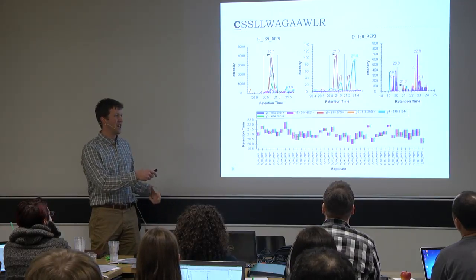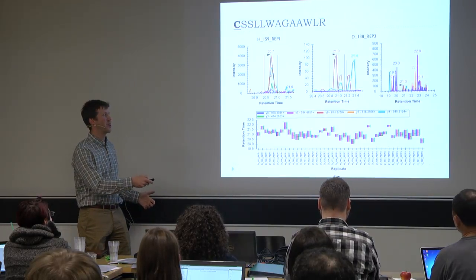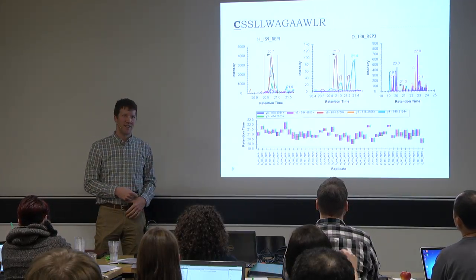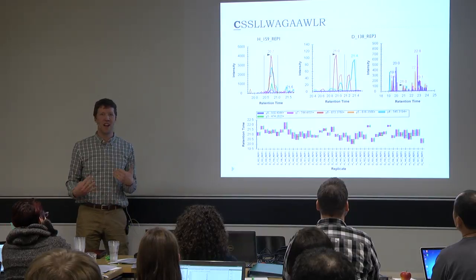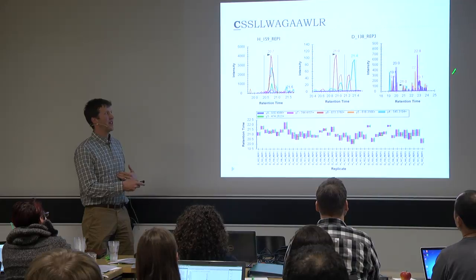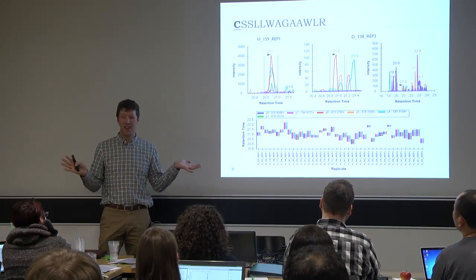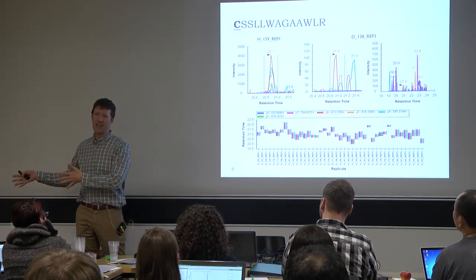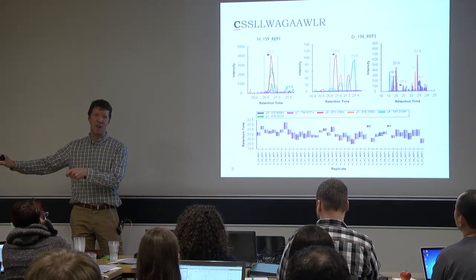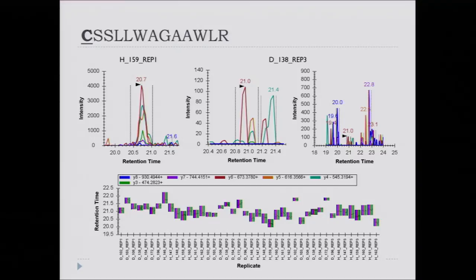But then if you look zoomed out at the entire 5 minutes that we measured, you can integrate the entire range, and you wouldn't have as much peak area as this. So there's nothing else there. So then the only other question is, is it possible that we just didn't capture this in our window? Especially if we measured all healthy and then all diseased, maybe we had a chromatography change in between, and that peptide is just not inside this window, so it's not measurable.